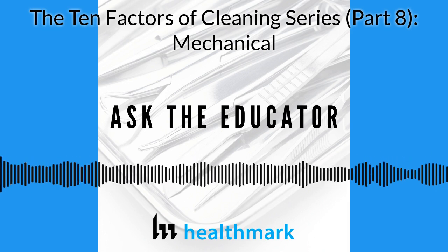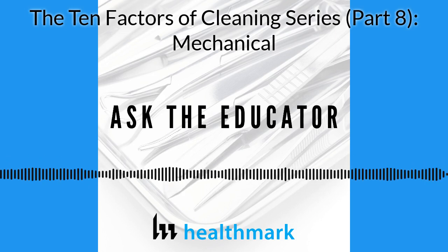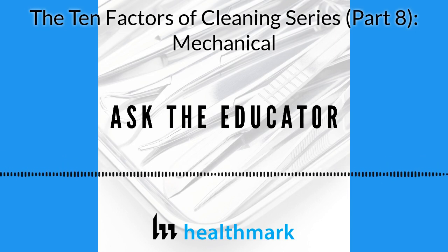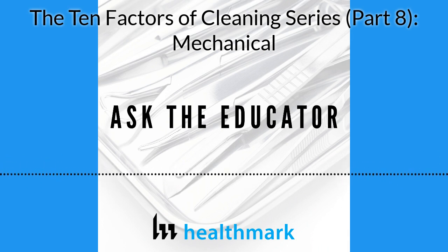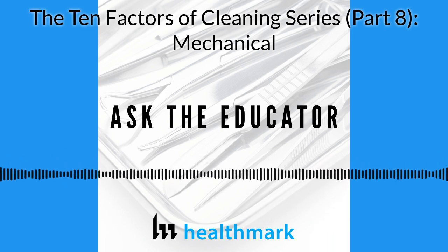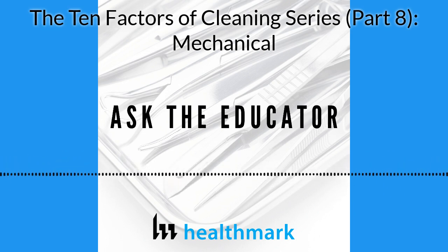We're running short on time on this one, but I think we did a good job explaining the mechanical side of your automated equipment. Hopefully that was a good introduction for our audience. Steve, do you have anything? This was a good introduction to get people to think, talk to your peers, see what's going on, and show them how you went from manual with the friction. Impingement is what you're looking for, one of the mechanical factors in your mechanical cleaning equipment. Thanks, Kevin. Enjoy it as always, my friend. Me too, Steve. Thanks for joining me.